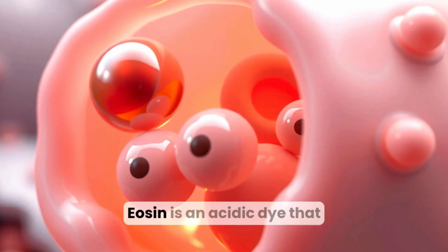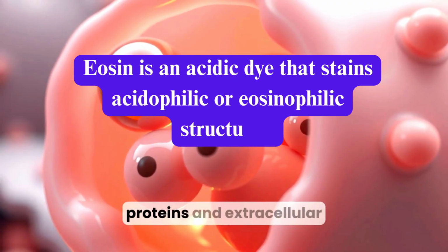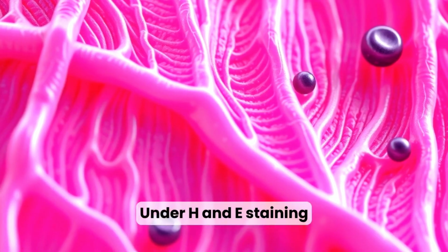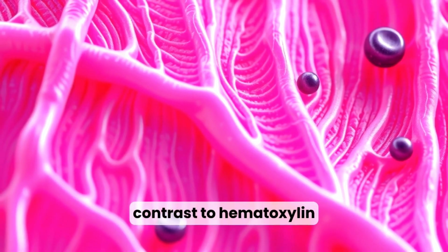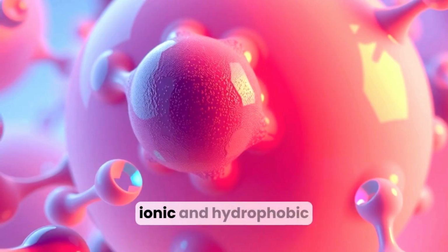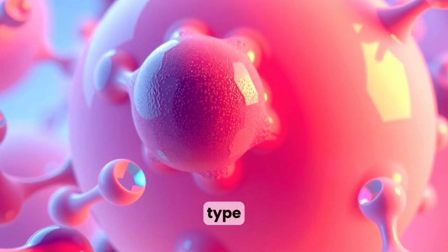Eosin is an acidic dye that stains acidophilic or eosinophilic structures, including most cytoplasmic proteins and extracellular matrix components. Under H&E staining, cytoplasm, collagen, and muscle fibers typically take up shades of pink, providing contrast to hematoxylin-stained nuclei. Eosin binds proteins through ionic and hydrophobic interactions. The result is a range of pink hues depending on protein concentration and type.